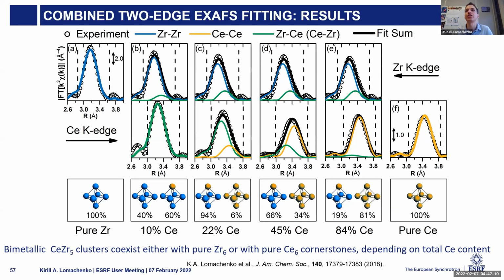The number of parameters grows much slower than the number of data sets, the amount of data. And the same is true for the Debye-Waller factors. So this allowed us to fit the whole thing without too much problem with correlations. And the data fitted quite nicely, so the result is good.